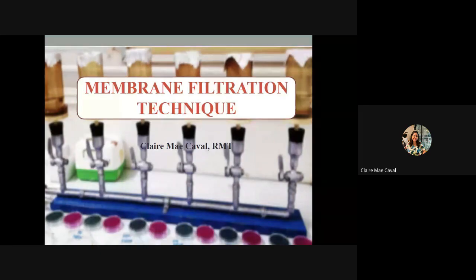Hi class! This pre-recorded lecture is about membrane filtration technique and heterotrophic plate count method. These are some of the methods used when evaluating microbiological quality of water. So again, the membrane filtration technique and heterotrophic plate count are used in drinking water. It can be used in your wastewater and recreational water, but series of dilutions should be done.